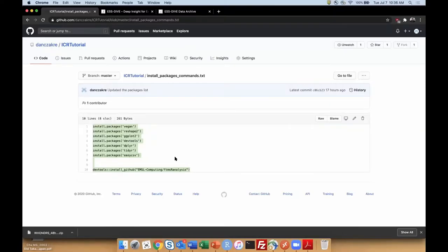Regarding the numbers in the sample columns, those are just the peak intensities, the intensities associated with the masses, and so how intense in the spectra they were. And as for our data, it is prudent, in R, to set those to 1 if they have a number, or set them to 0 if it's 0: presence, absence.